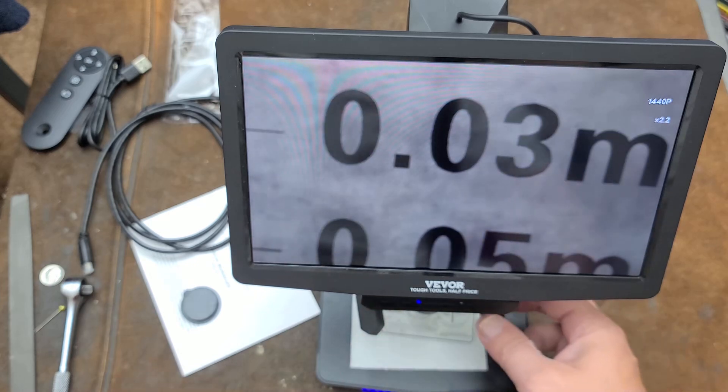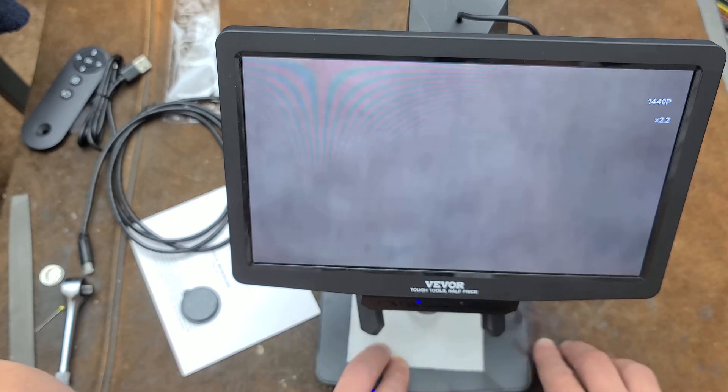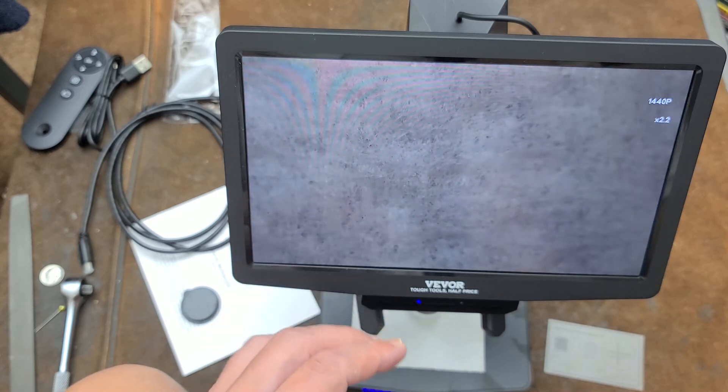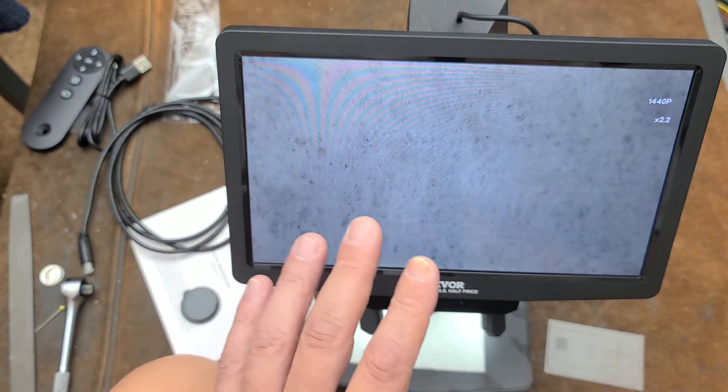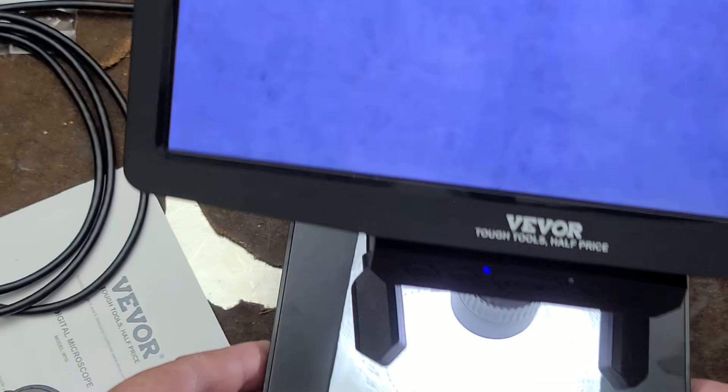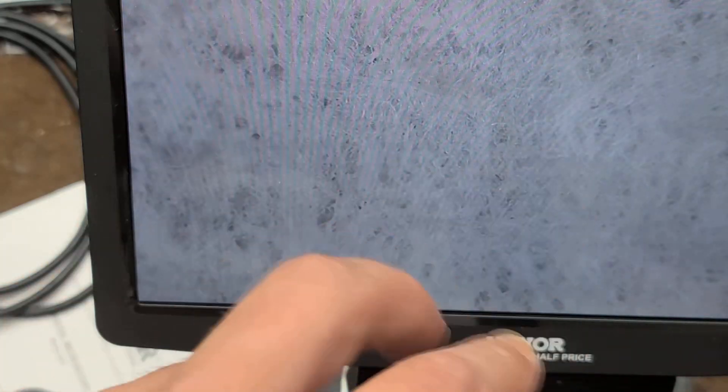We have two different sets of lights here. We have an ambient light which isn't particularly bright but it's more of just a diffuse flood. We're illuminating a piece of very fluffy toilet paper. You can actually see a lot of the individual fibers. If we turn on the ring light which is much more intense, certain applications you want the intense ring light that's built into the bottom of the lens. But a lot of times it's just too much and being directly on top causes too much reflection, so they do have a couple different sets of lights.